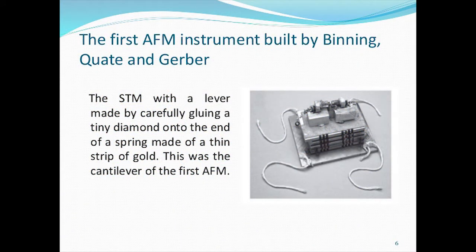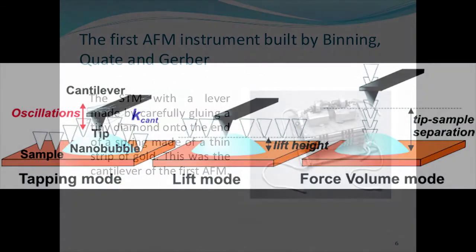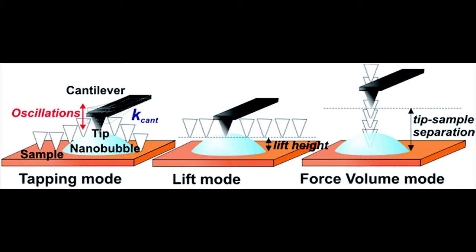The optical AFM version 4 was also developed in 1989. The fourth prototype of the AFM generated interest in commercial development and implementation of AFMs. In 1993, tapping mode was first introduced. In this mode, the cantilever oscillates at its resonant frequency. But unlike non-contact mode, the cantilever taps the surface during the scanning, greatly reducing the damaging lateral forces.